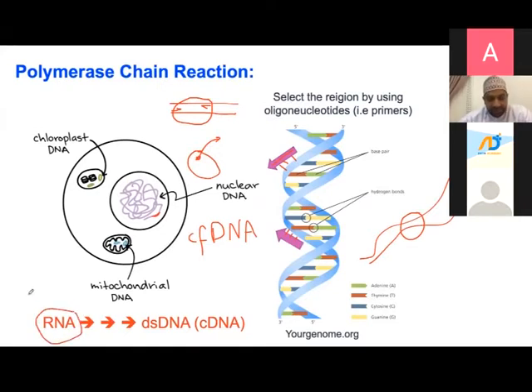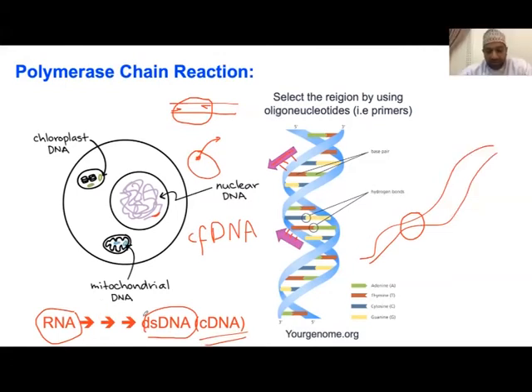If you have an RNA molecule, because most of the RNA can be single strand, but we still have some viruses which are double strand RNA. PCR works on a double strand nucleic acid. So you need to convert this to a DNA molecule through reverse transcriptase. And we call it sometimes cDNA. In any case, this molecule needs to be a double-stranded nucleic acid. So you need to do an extra enzymatic reaction to convert RNA to double-strand DNA.